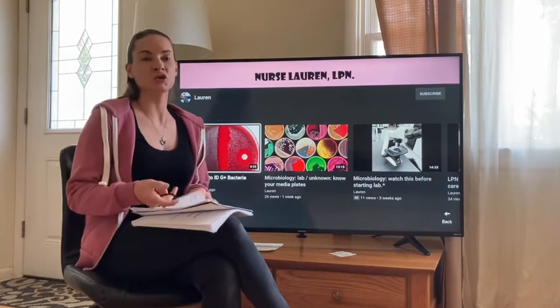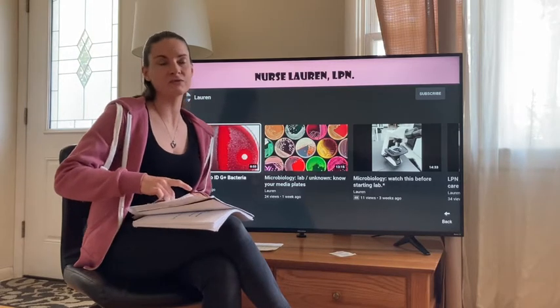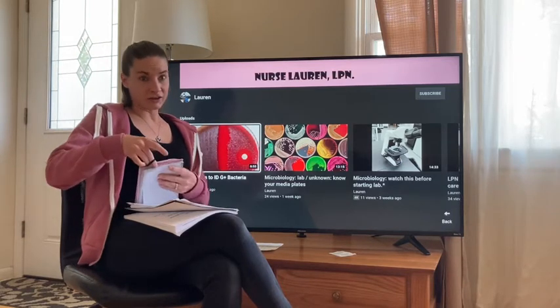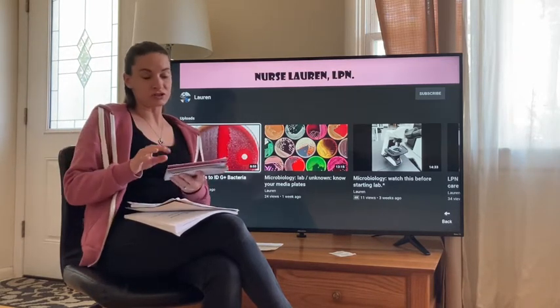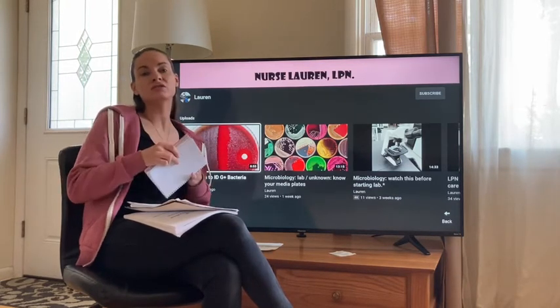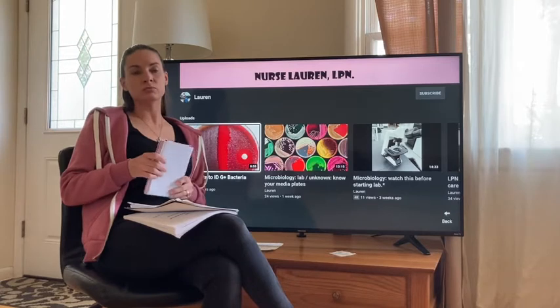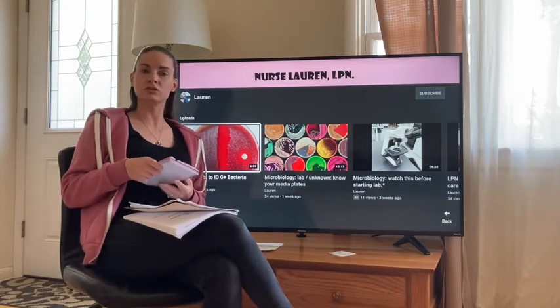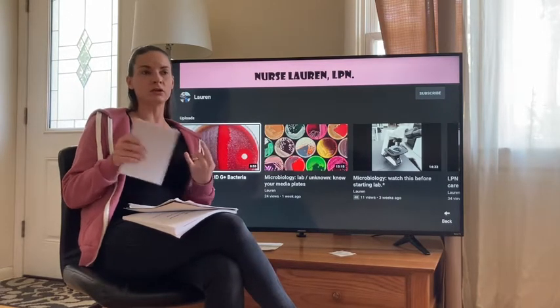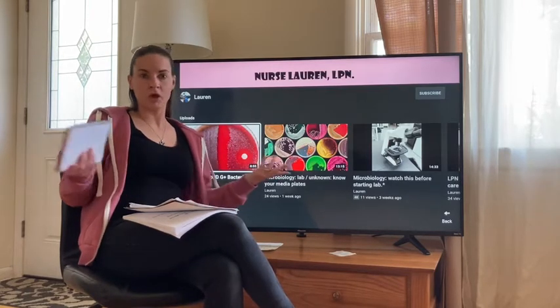Okay, so this video is going to be on tests for identifying gram-positive bacteria. Again, this video, or actually this whole series, will help you get ready for your unknown. And if you're watching this video trying to get ready for micro, because you're about to start your lab, this will be a head start for you because you'll know how to do the tests for gram-positive bacteria, and then you'll know what you're actually testing for, etc.